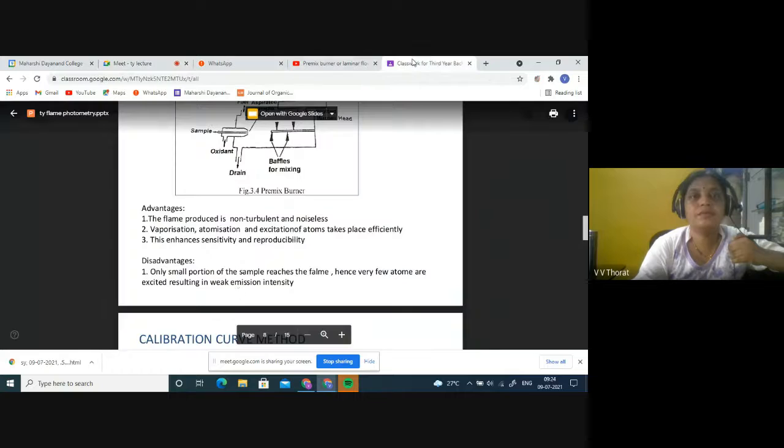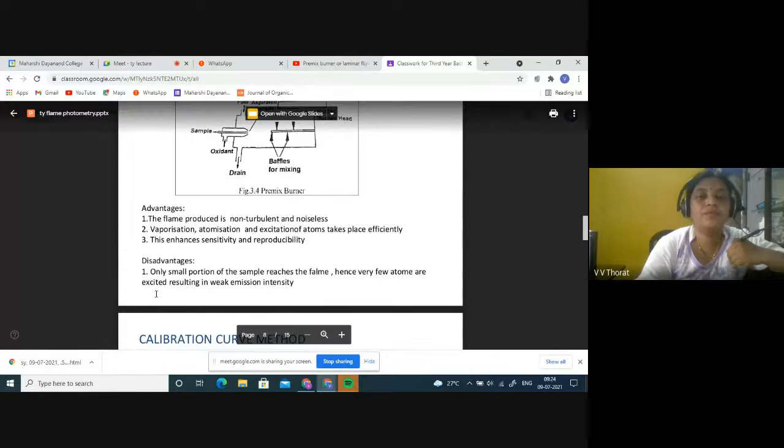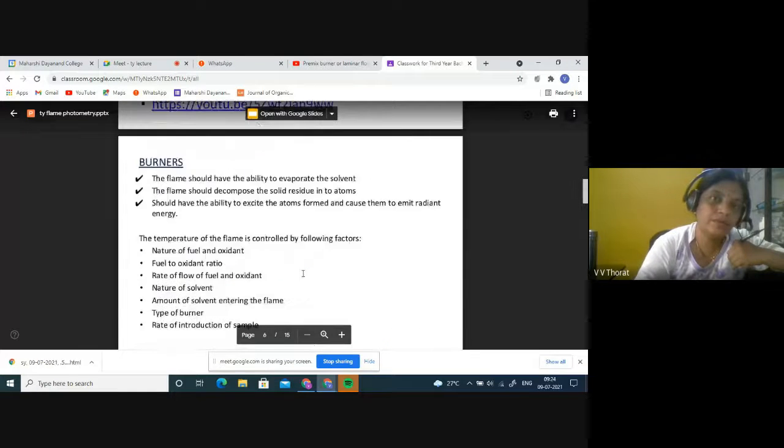Where was I? Yeah. So I hope you will not forget this now. Only a small portion reaches the flame. The spelling of flame is wrong, yes? FLAME. And hence only a few atoms are excited. So now we go to the next component.